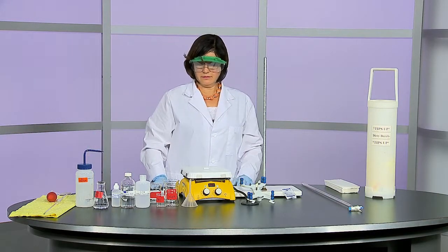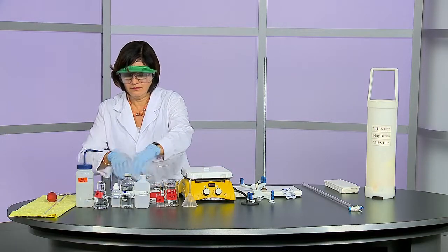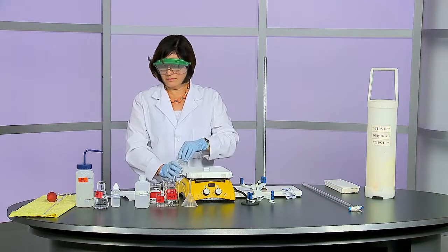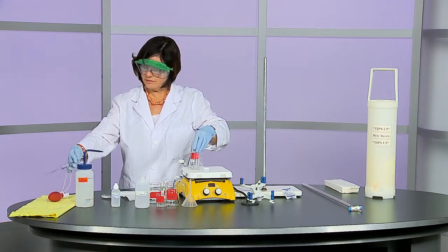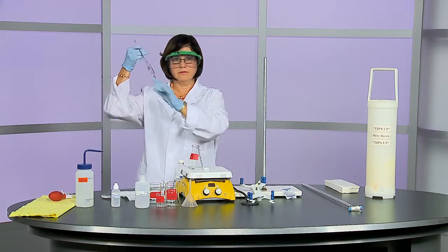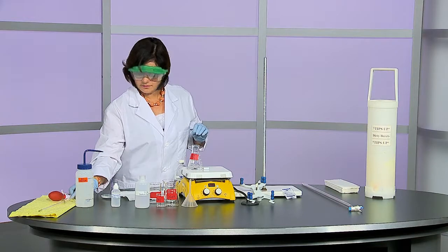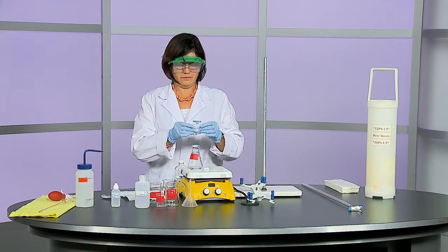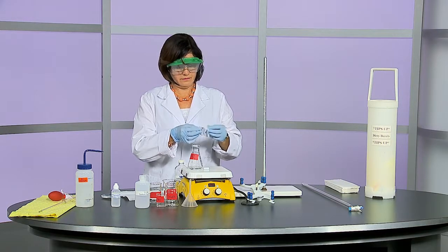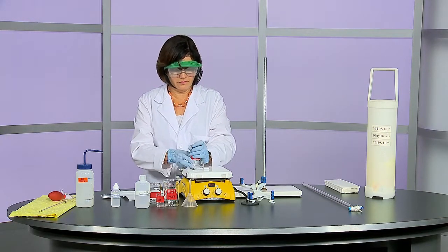First, measure the analyte. We have already pipetted the hydrochloric acid solution into an Erlenmeyer flask using a 15 milliliter pipette. If you do not know how to pipette, watch the video titled Using a Volumetric Pipette. Don't forget to condition the pipette before use. Label the flask, cover it with a small watch glass or parafilm, and leave it on the side while you prepare the burette.